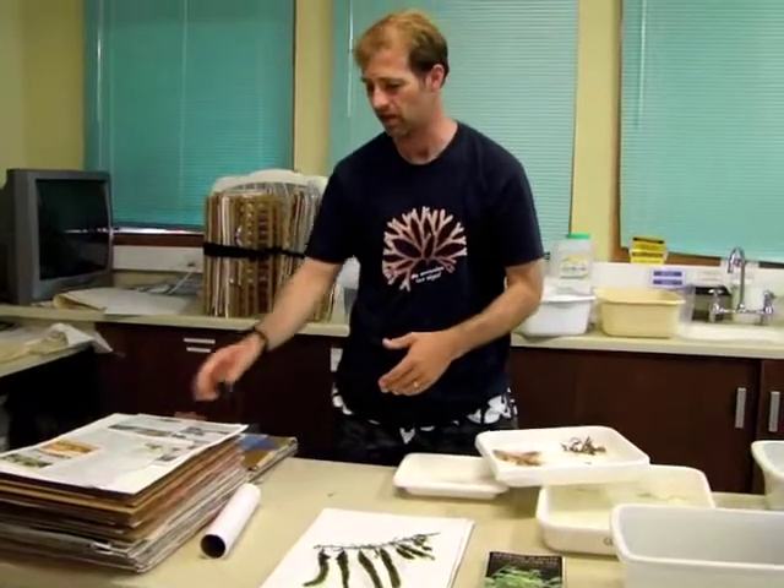We can attach notes to the specimen. We often put a label on here that will have the species name, where it was collected, when it was collected, and who collected it. Basic information, including the kind of substrate it's on.